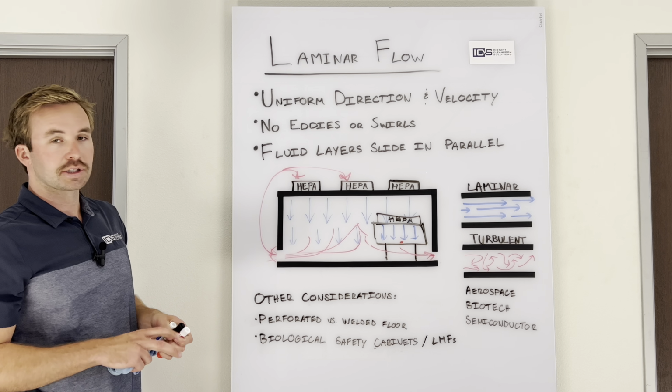In order to do this, it didn't make sense to have air flowing down because really we're cleaning the inside of this tube. And that was what was required for the bigger picture. And so instead, we put the HEPA filters on this wall. The entire wall was made of HEPA filters. And it flowed all the way out until it exhausted all over here.